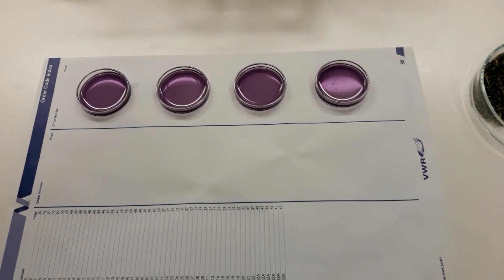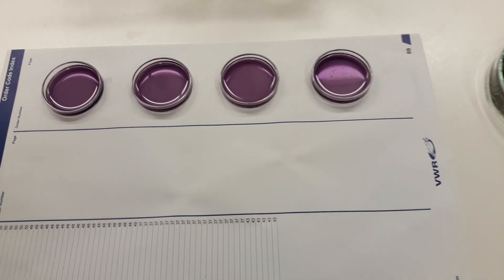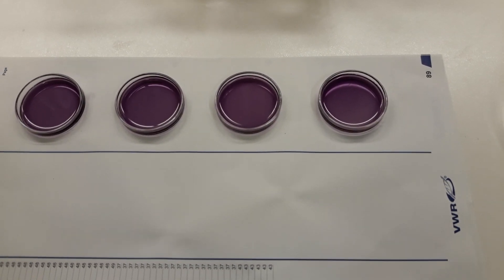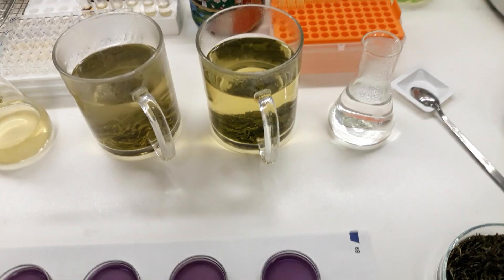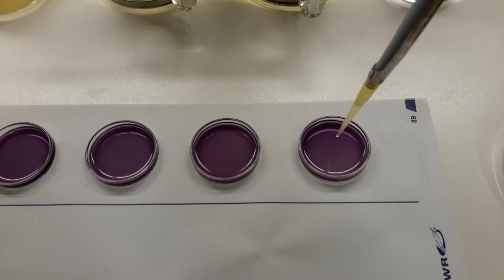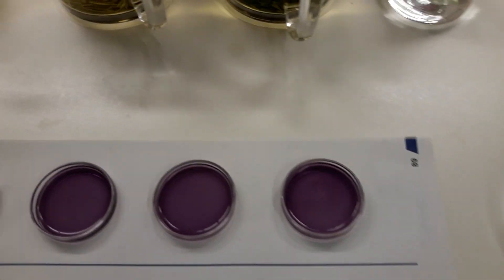Now I have two milliliters of my DPPH solution — a free radical as I mentioned earlier — in these little Petri dishes. I will add an equal quantity of each of the four different preparations. First I go to my boiled water: about 100 microliters, dropped slowly into the solution. You can see there is some change in color happening, but not that much.